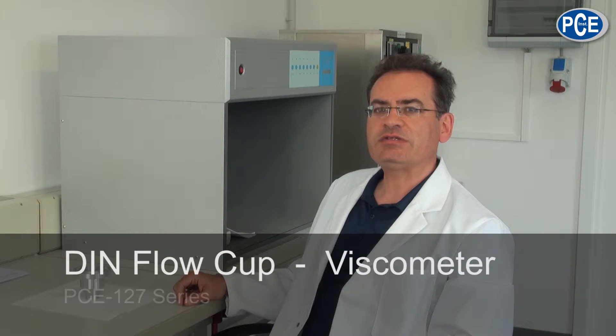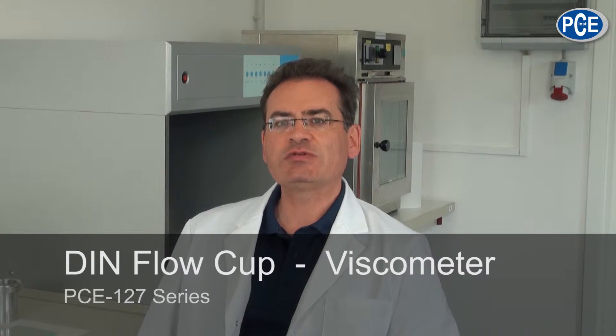I would like to present to you today the DIN Flow Cup 127. Viscosity plays a major role, especially in production in the industry.